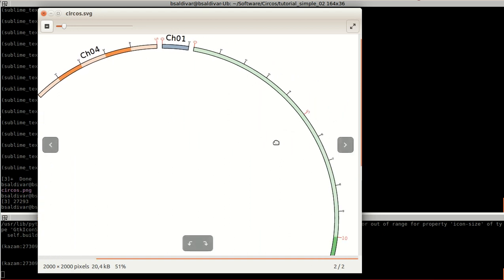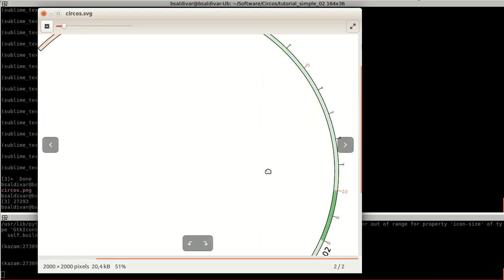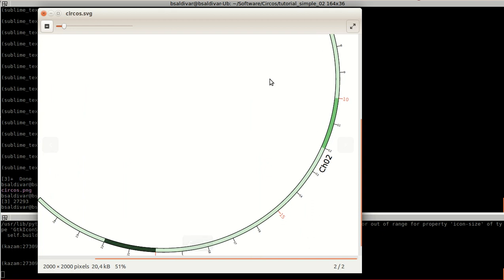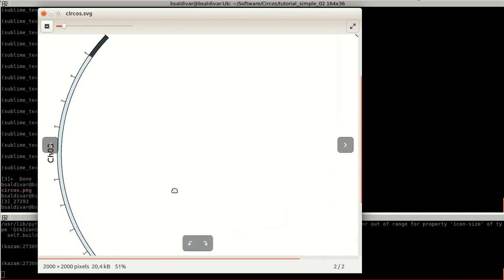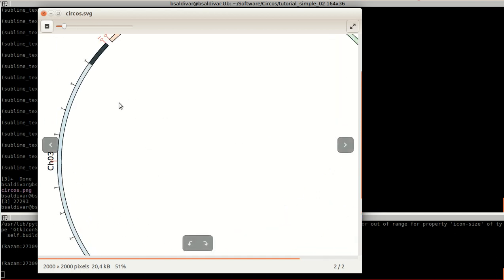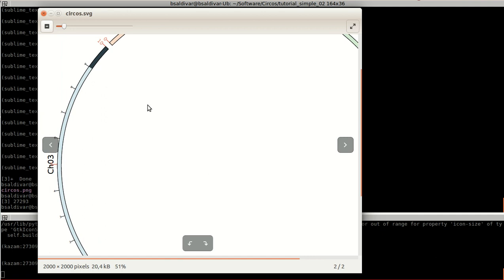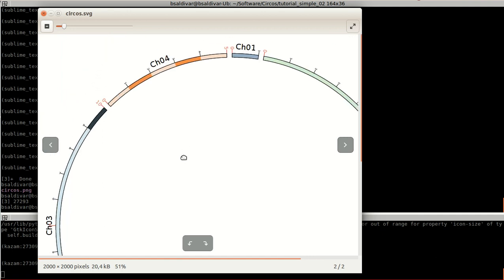In the case of this other area, it represents this light green area and this dark one over here. On the other side, this last part from 9 to 10 represents another band, and here in karyotype 4 we have two bands.